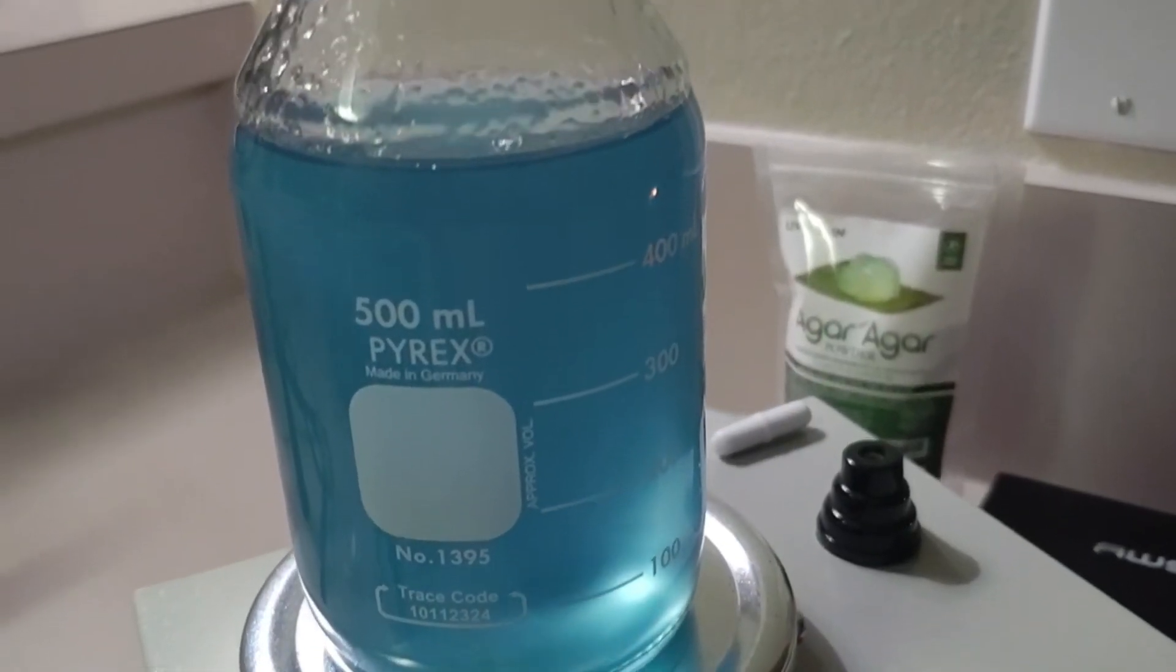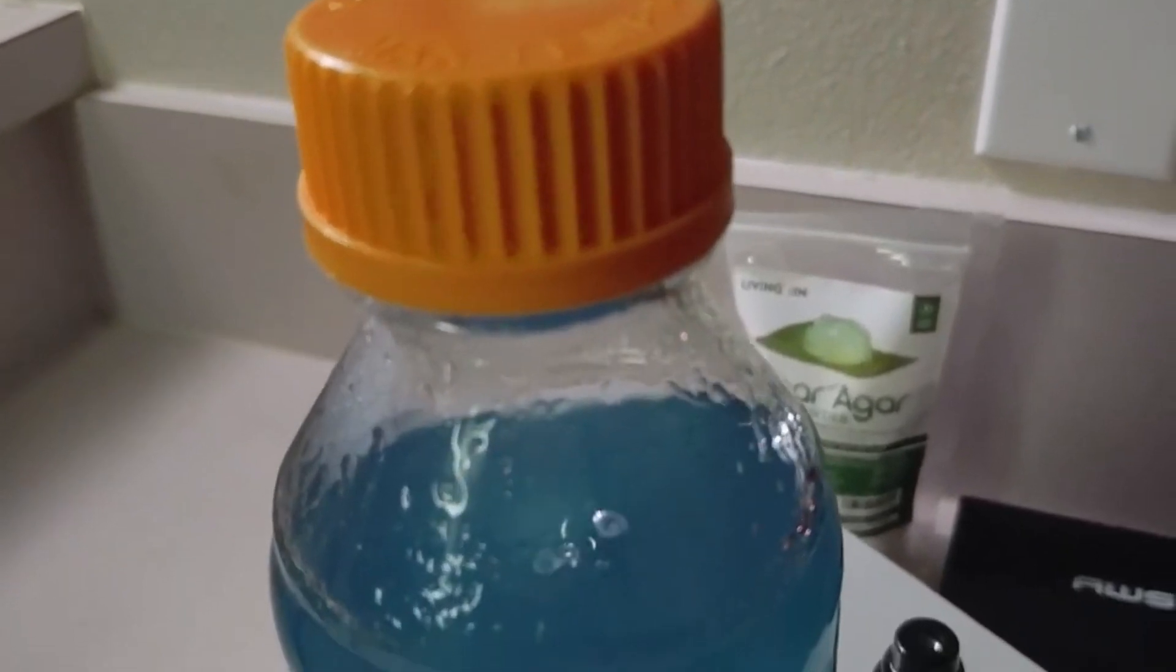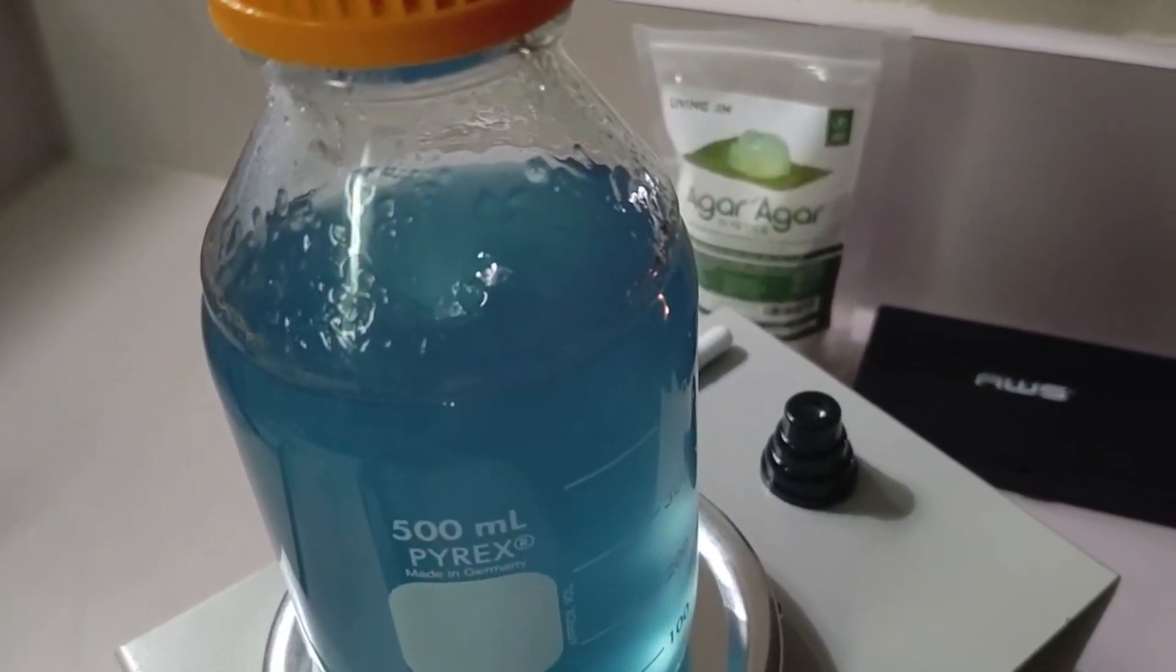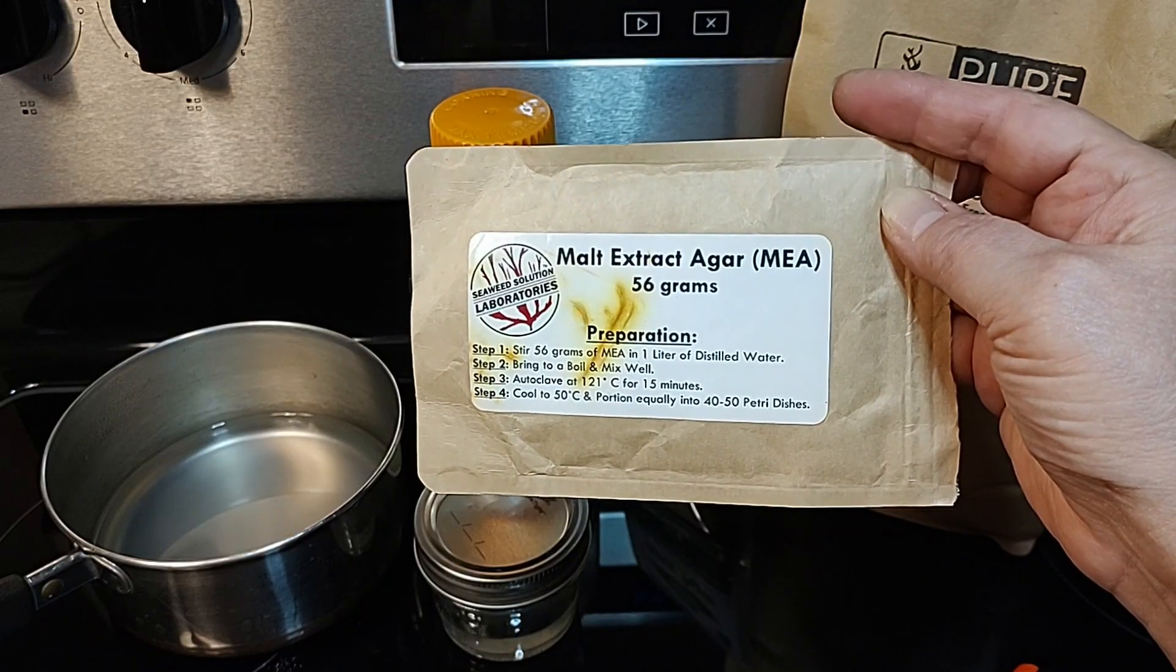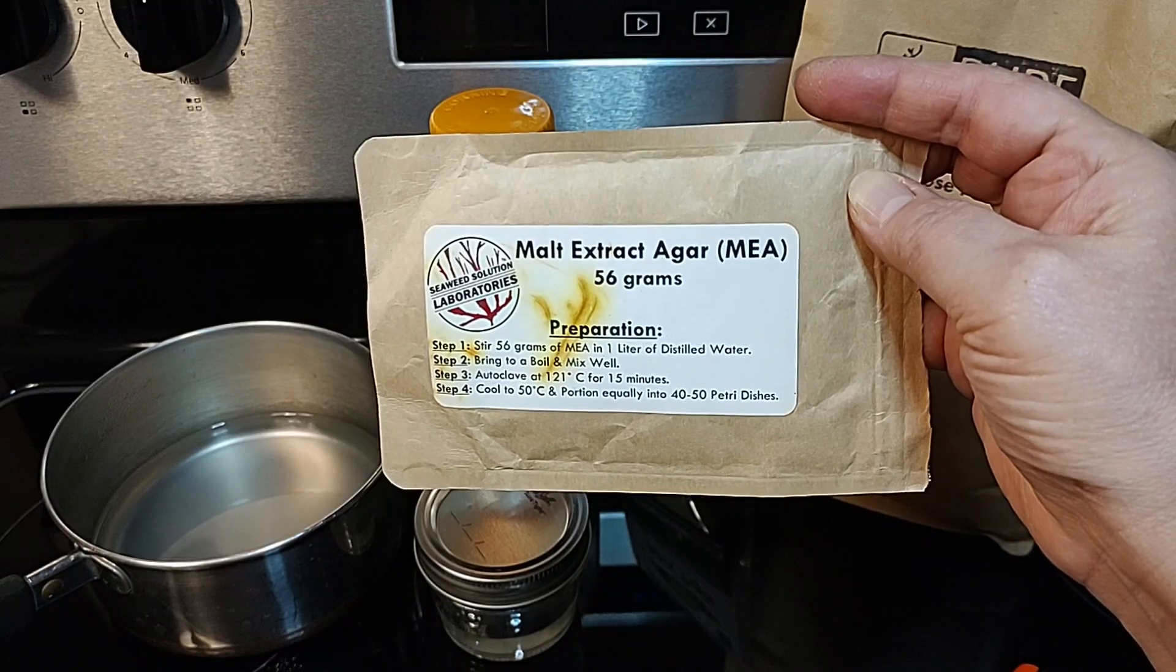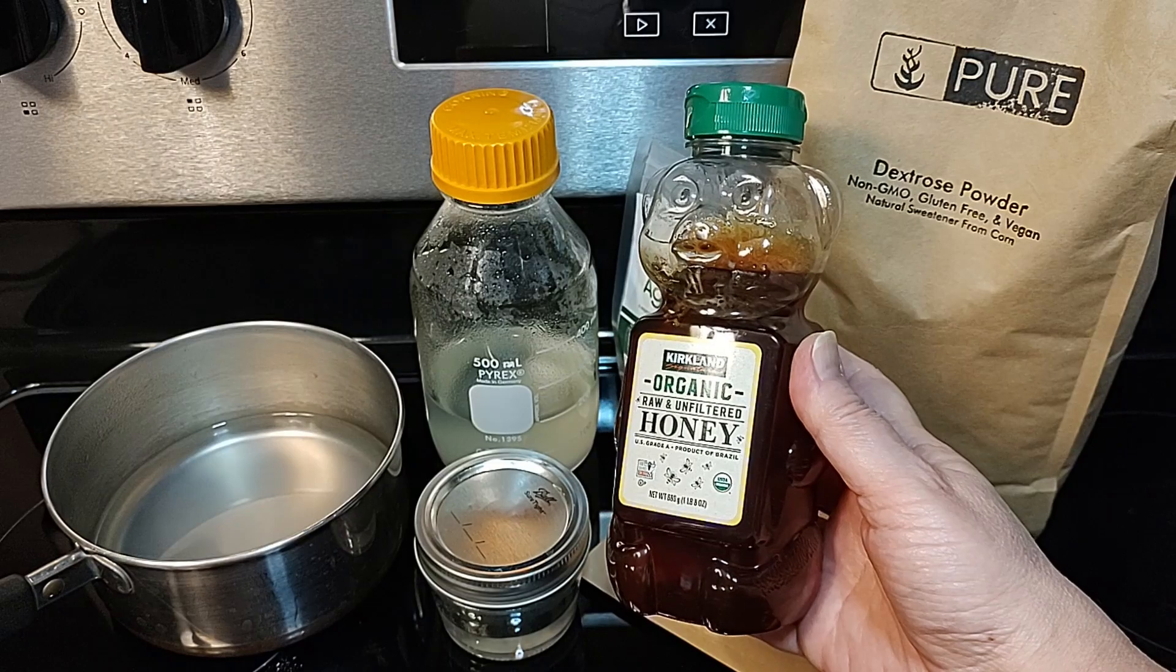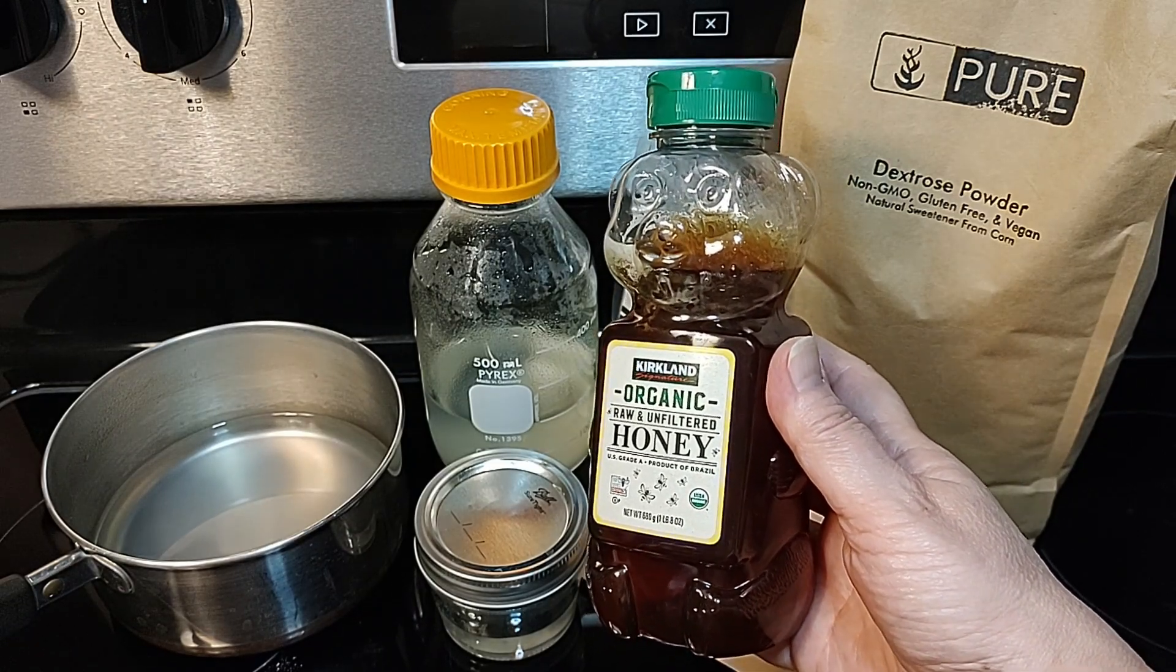There are dozens of recipes for agar, however when you break it down to the basics it's all about nutrition and sugar. We are not talking about cane sugar, we are specifically talking about dextrose which is in most MEA blends and honey. Some use popcorn grain to create a corn syrup water known as grain water.